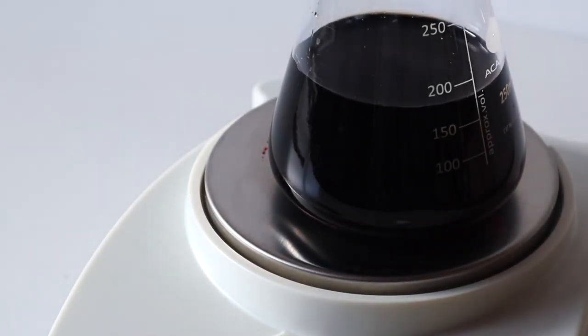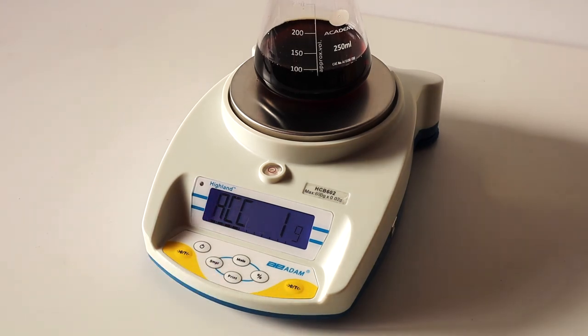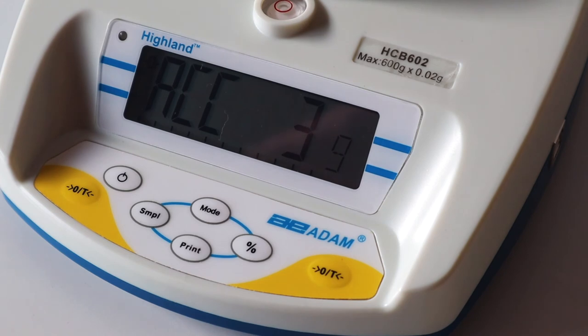If you need to add up multiple weights, use the Accumulation function. Each time you add an item to the Highland, press the Print button. When you've finished with nothing on the balance, press the Print button to see the accumulated total.